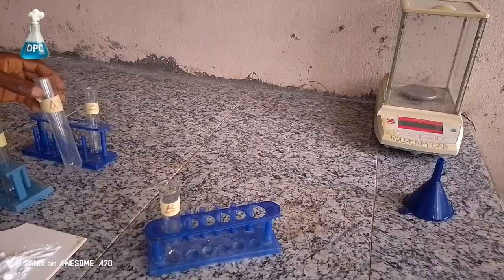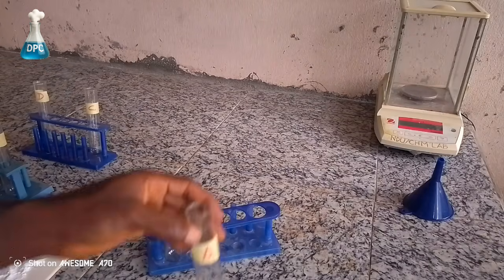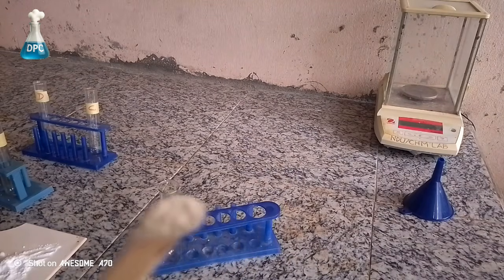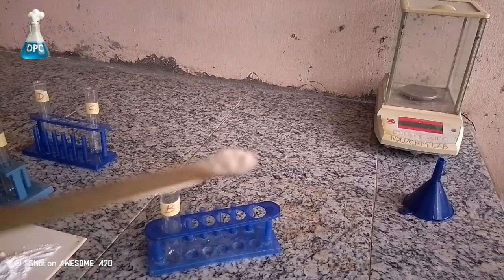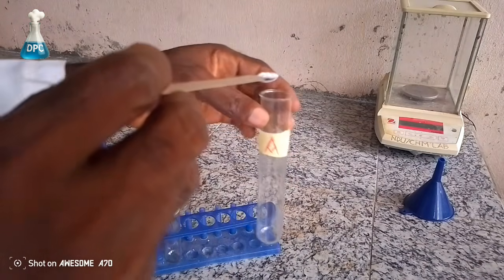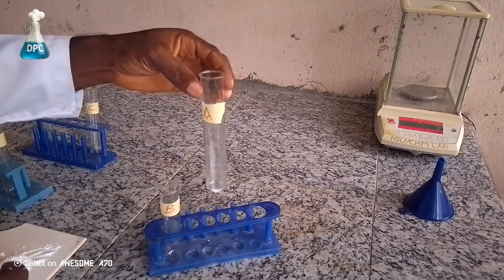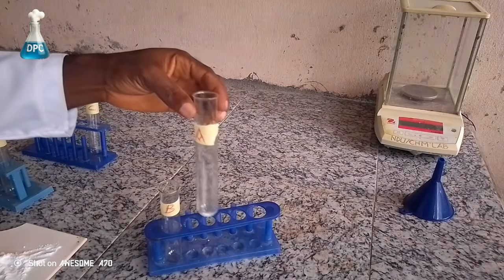Now, to start with is test tube A, which is to contain 3 spatulas of sodium hydrogen carbonate. You should take note of how it is being loaded. The level is a kind of water level. Don't excessively fill it. Now that is 1 spatula. Now we need the second spatula and then the third spatula.